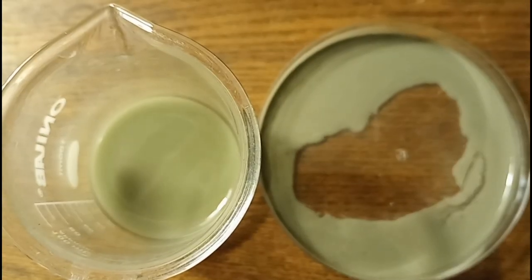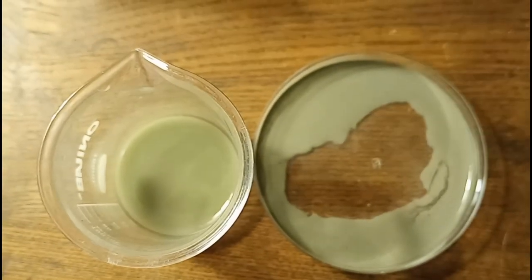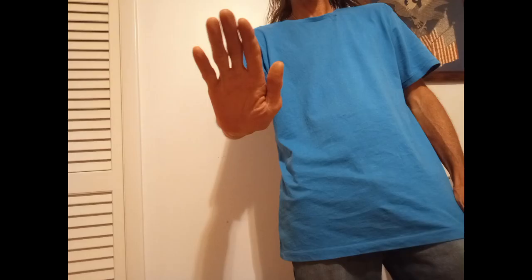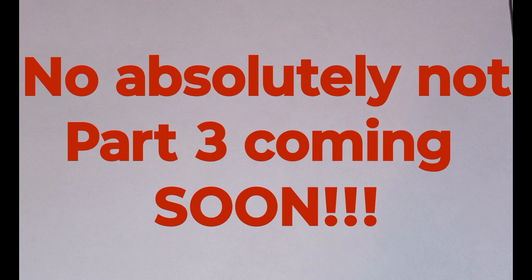I decanted off as much of the liquid as I could from the sediment and then put it in a petri dish to air dry. I want to wrap up part two and get it out there. "Hey — does this mean you're giving up? Are you quitting on me?" No, absolutely not — part three is coming.